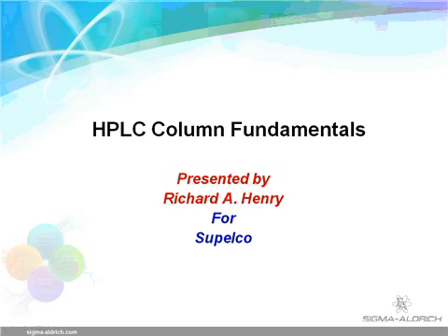HPLC Column Fundamentals. The seminar HPLC Column Fundamentals provides an introduction to how solutes can interact with columns containing porous particles and stationary phases to result in separation. The efficiency, retention, and selectivity terms in the resolution equation will be explained, as well as how certain particle and column characteristics can alter the terms and affect resolution.